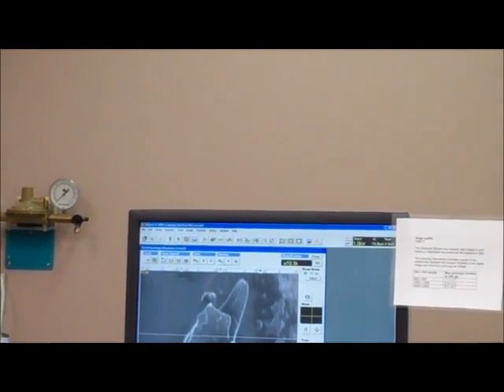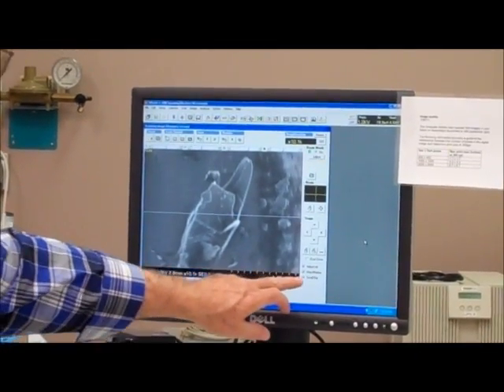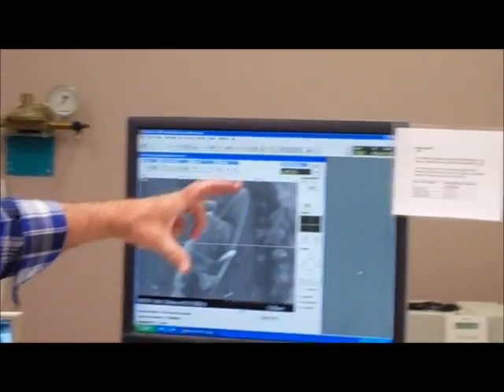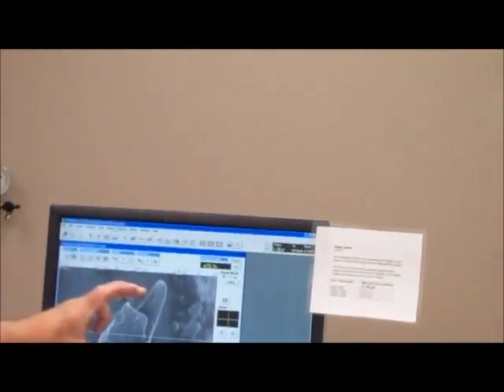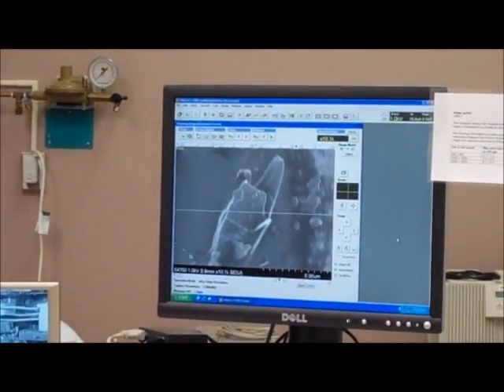So there's a series of vertical marks right here, and from the one on the far left to the one on the far right, that distance, or approximately this distance, is equal to 5 micrometers on the surface of the sample.